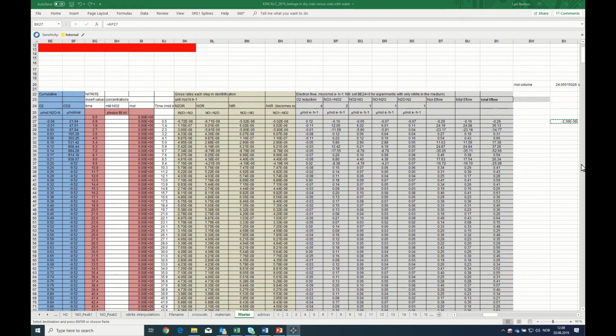But what I want to have here is the nanoliter N2 per injection minus 1, and in order to calculate that, I have to have the rate per hour here, and I multiply it by the same time span that I calculated the rate for, and that is in mole N2 now.